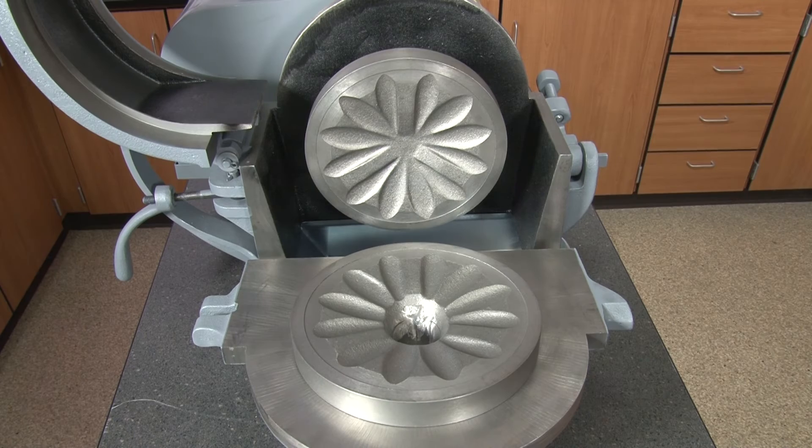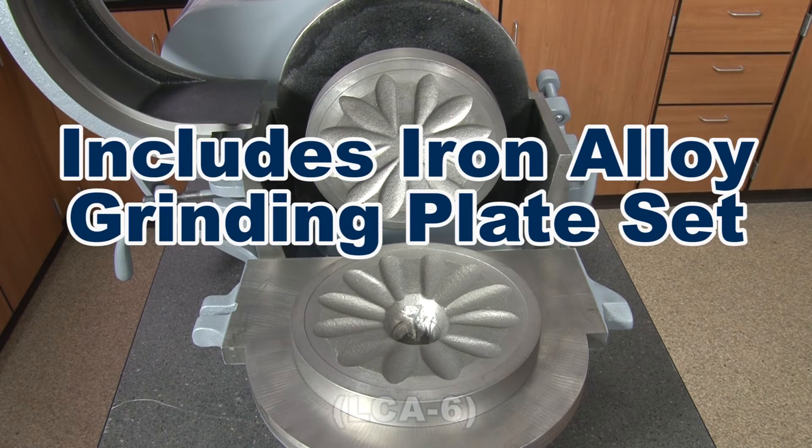Both stationary and revolving grinding plates are easily replaced, and the Bico Pulverizer includes the Gilson LC-A6 Iron Alloy Grinding Plate Set.